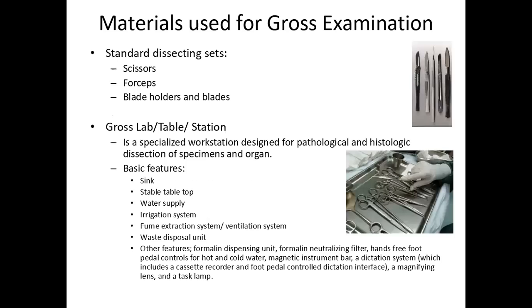Materials used for gross examination. So we have the standard dissecting sets. So example of it, no? Or under it we have scissors, forceps, and also the blade holders and the plate.